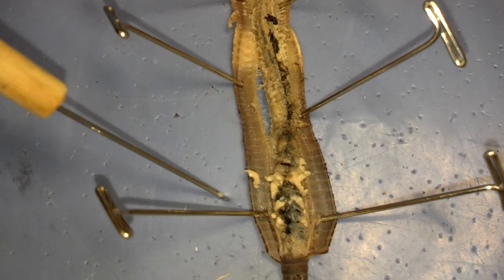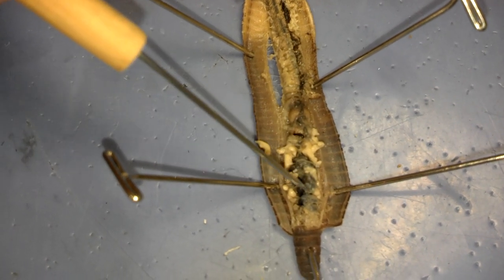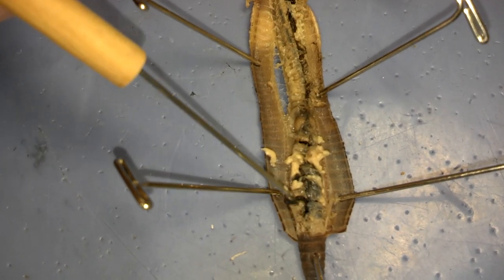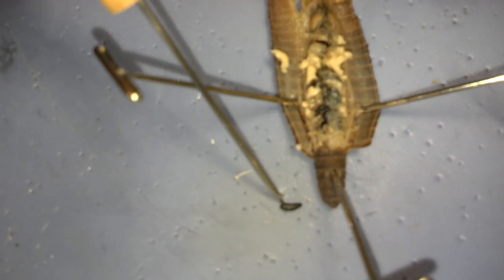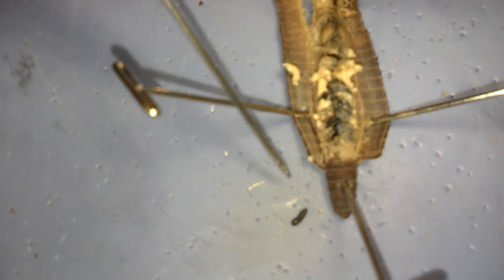You'll see dark bands that almost look like little black bananas inside here. We're going to try and break one of those off and take it out. There's one right here — it looks like a small little black banana. That's half of an aortic arch, which is the earthworm's heart.